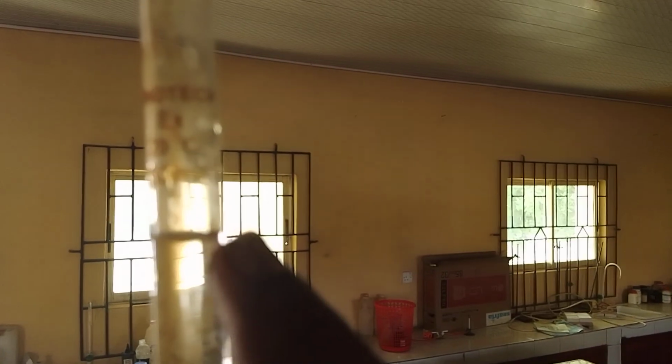The A inside now is at 0. You can see 0 here. This is 0, 1, 2, 3. At 0, you can see the meniscus. The liquid bends inward. So the tip of that meniscus touching this line shows that my initial reading is 0.00.